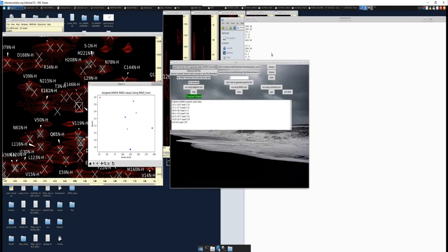Now with three amino acids, you can see that the distinction is far more clear. The very first one that you get, with an RMSD of 1.54, is this alanine to phenylalanine. The next one that you get is 2.1, so this is quite a bit higher. This becomes more apparent if you look at the plot below, or to the left. You can clearly see there's one match that fits better by quite a bit than all of the other matches.